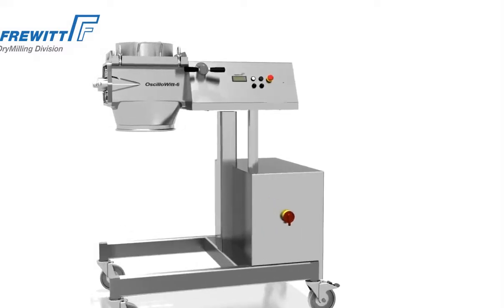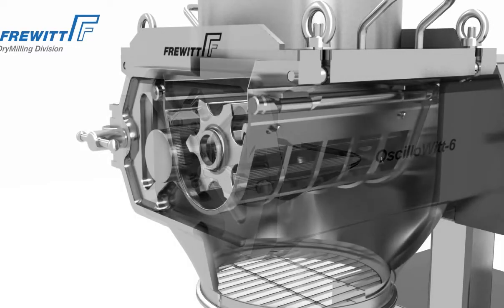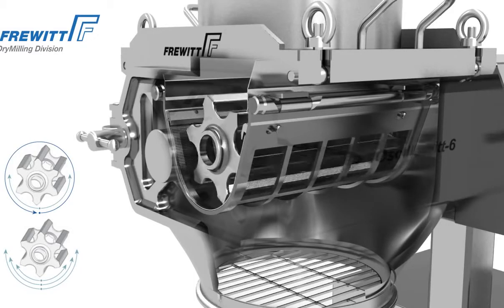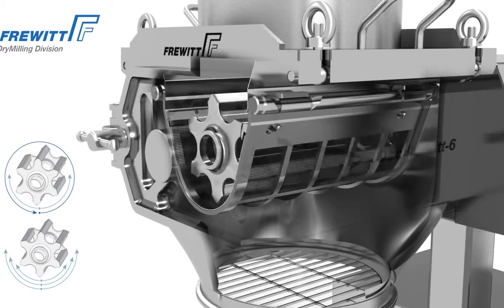The Osillowit rotor can be set to operate in either the oscillatory or rotary mode. Thanks to the continuous adjustment mechanisms, the product is gently milled with minimal heat buildup. The oscillation with superimposed rotation for maximum operating life is unique worldwide and patented.